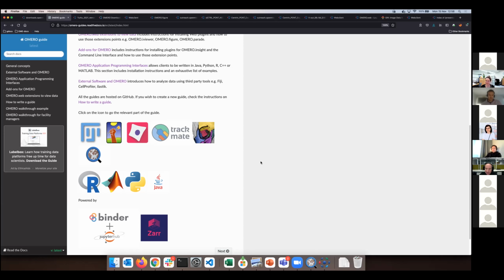Nice idea. But we are in a real world, okay? We still want to have the features for the users, and we have to let the users pay this small inconvenience that they will swap to OMERO Web, where our concentration and energy and development effort and testing and making sure that everything works went. What we are keeping up on OMERO Insight, if there is a bug or dysfunctionality of the import feature, we will fix it. If there is a regression, we will fix it, but not much more.